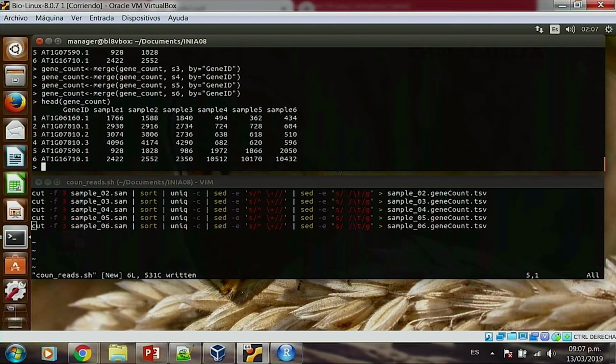That's a good thing about interpreters, that they do all these steps without us seeing them. Because if we had to put one command for every single step of that, we would go crazy.